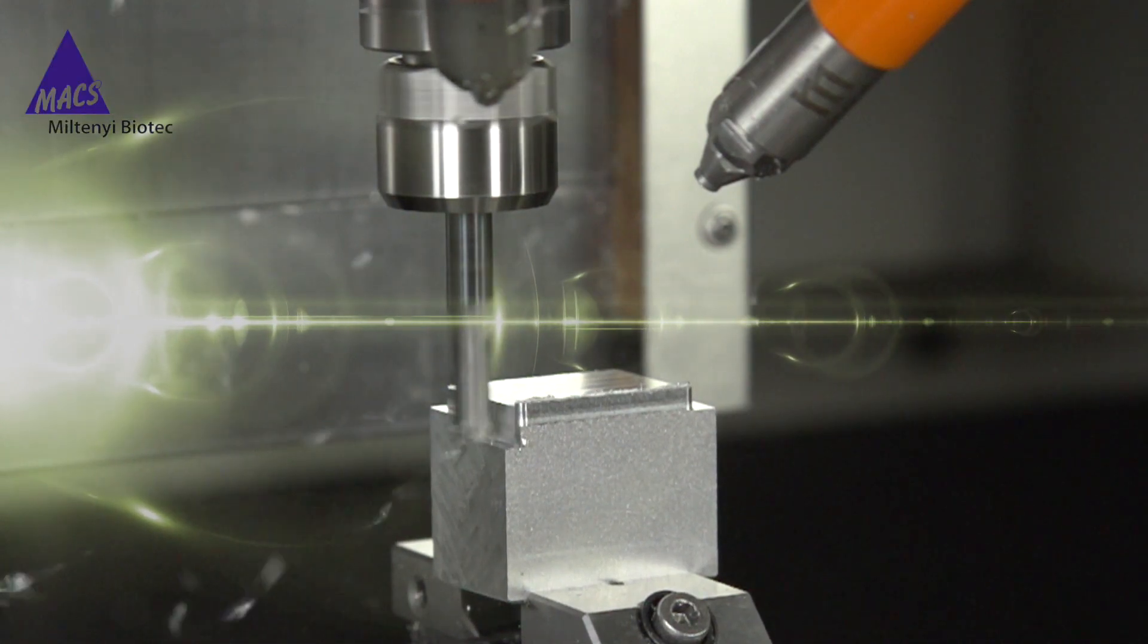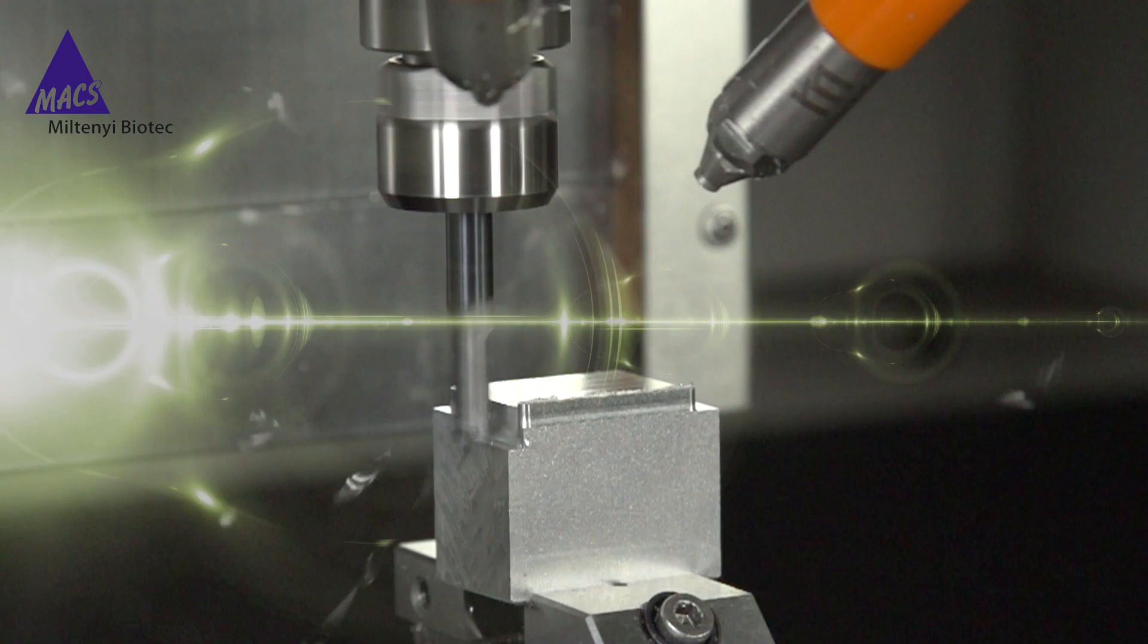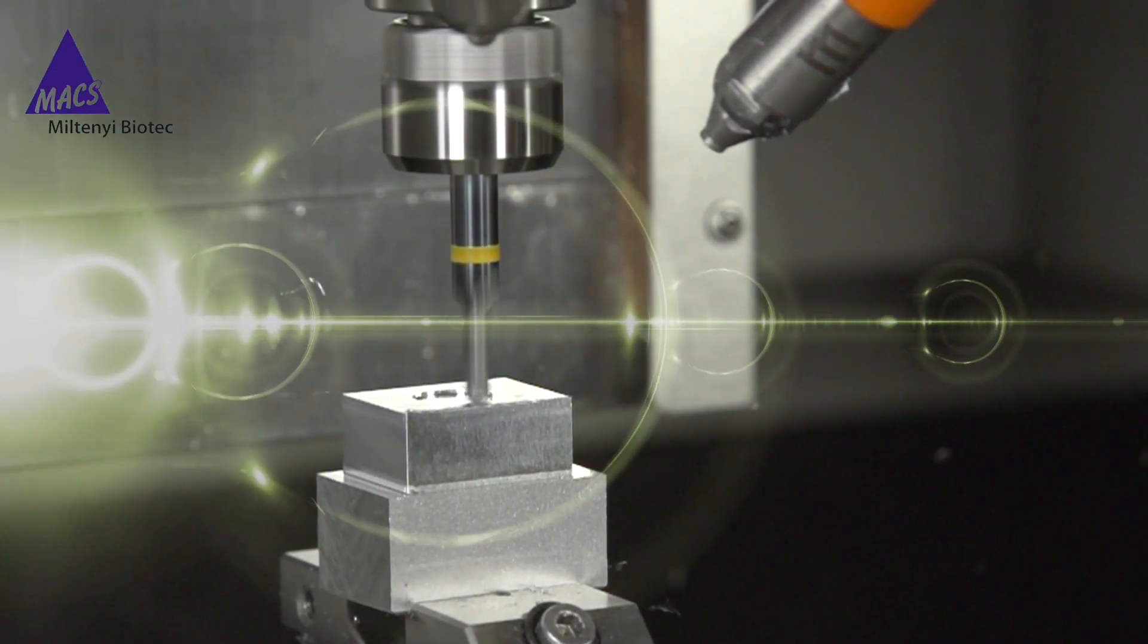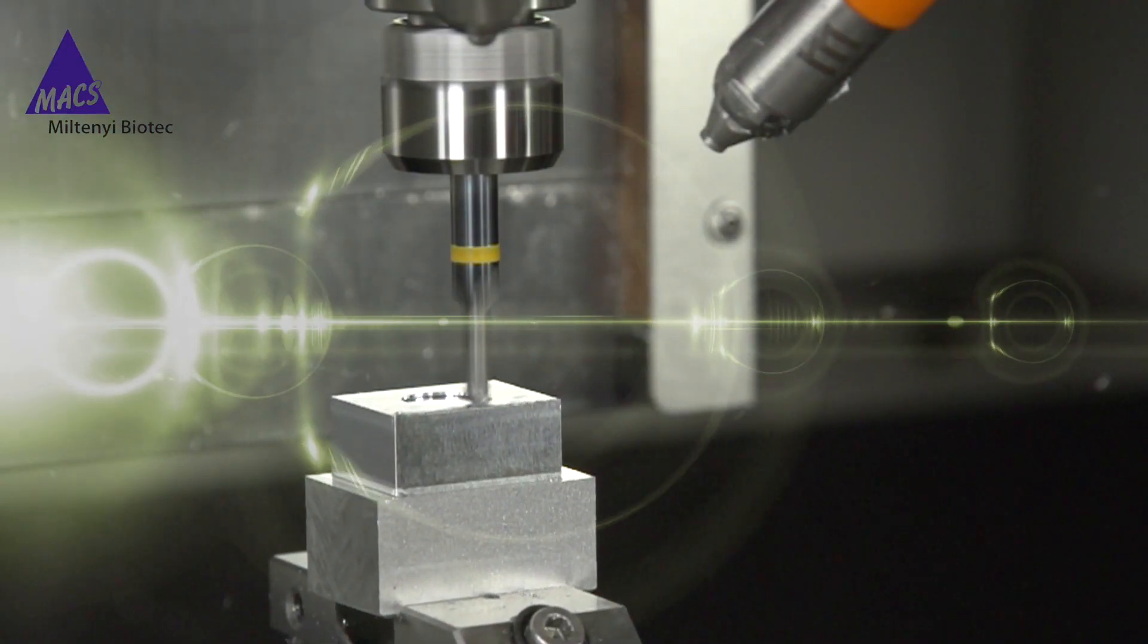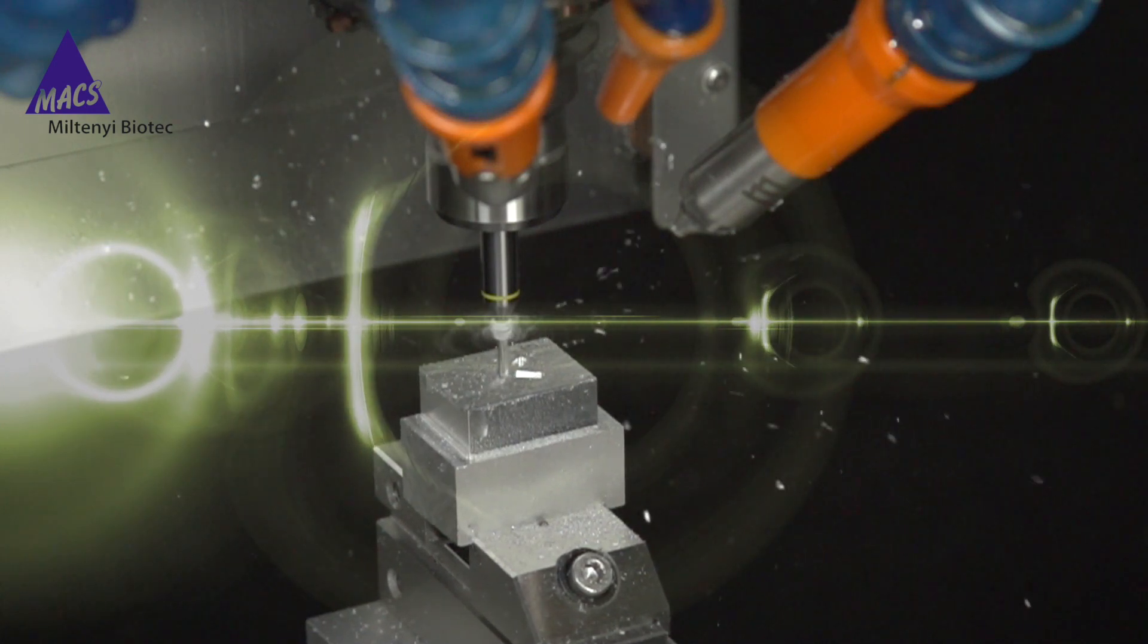How far can we take flow cytometry? How much better? How much easier? How much faster can we make it?